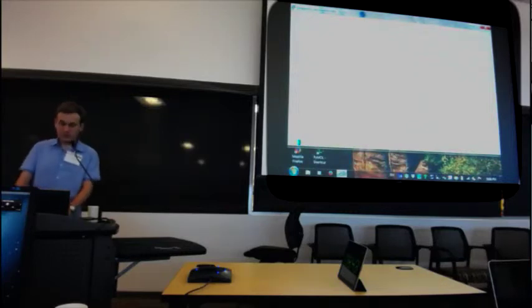Okay, so once you have converted all of the runs and indexed all of the runs like I showed you, you're going to run the merge all script.